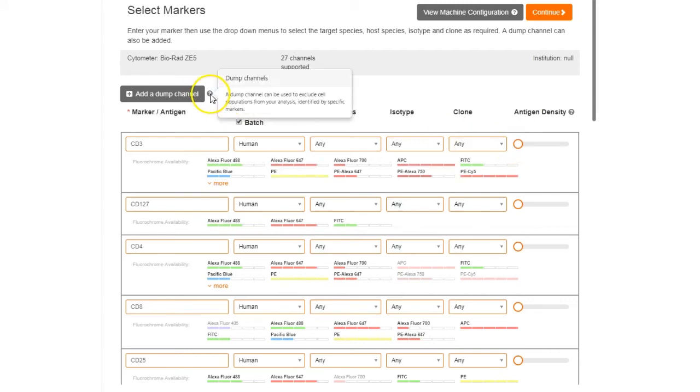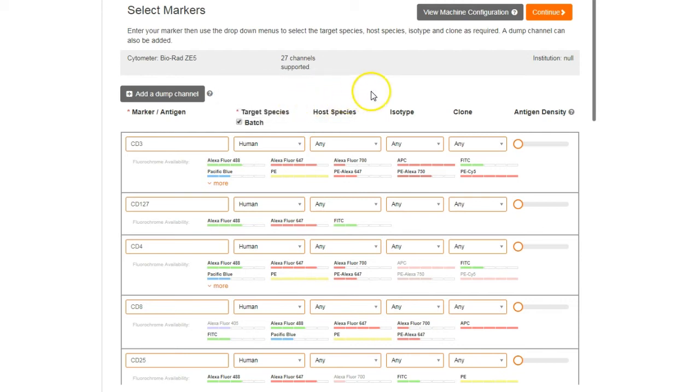The Dump channels feature allows you to exclude cell populations from your analysis. Simply add the markers that you wish to exclude.